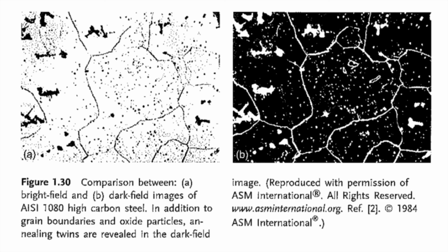So only when light is scattered, then it makes its way back to the objective. So closer in at those angles in that dark cone I drew. And so that's how we have contrast, is those scattered, the features that scatter the light bring it closer to the objective so we can see it. And so the contrast images appear light, the rest of it is mostly dark.